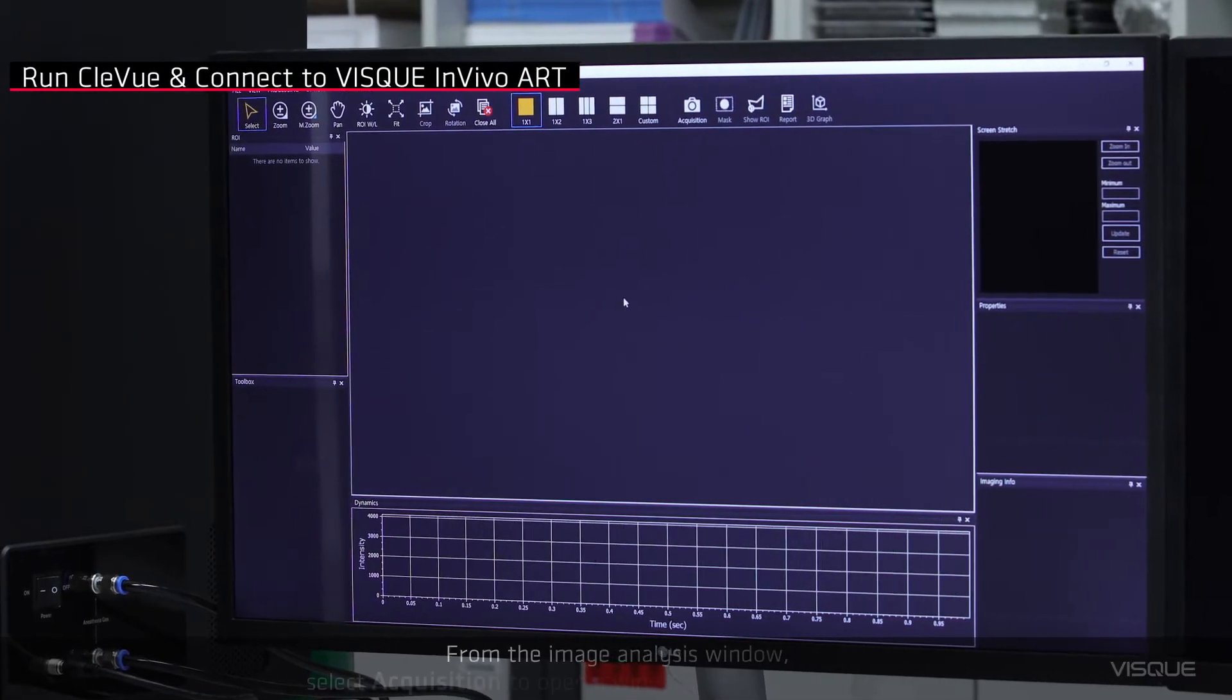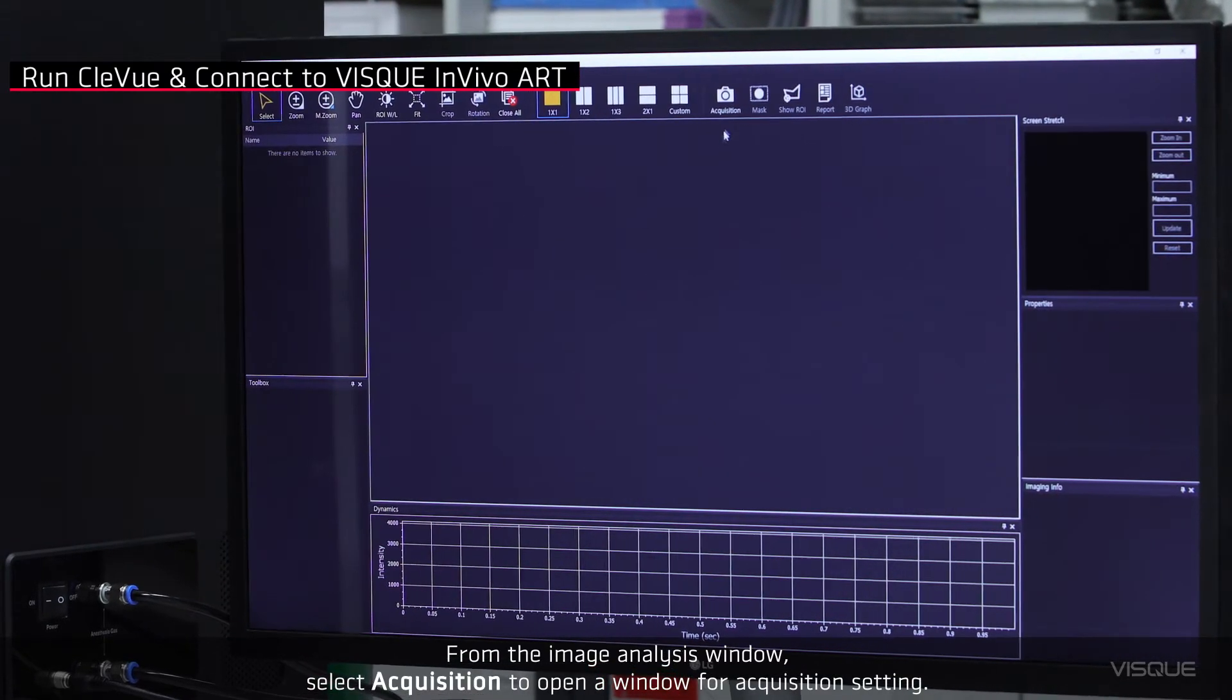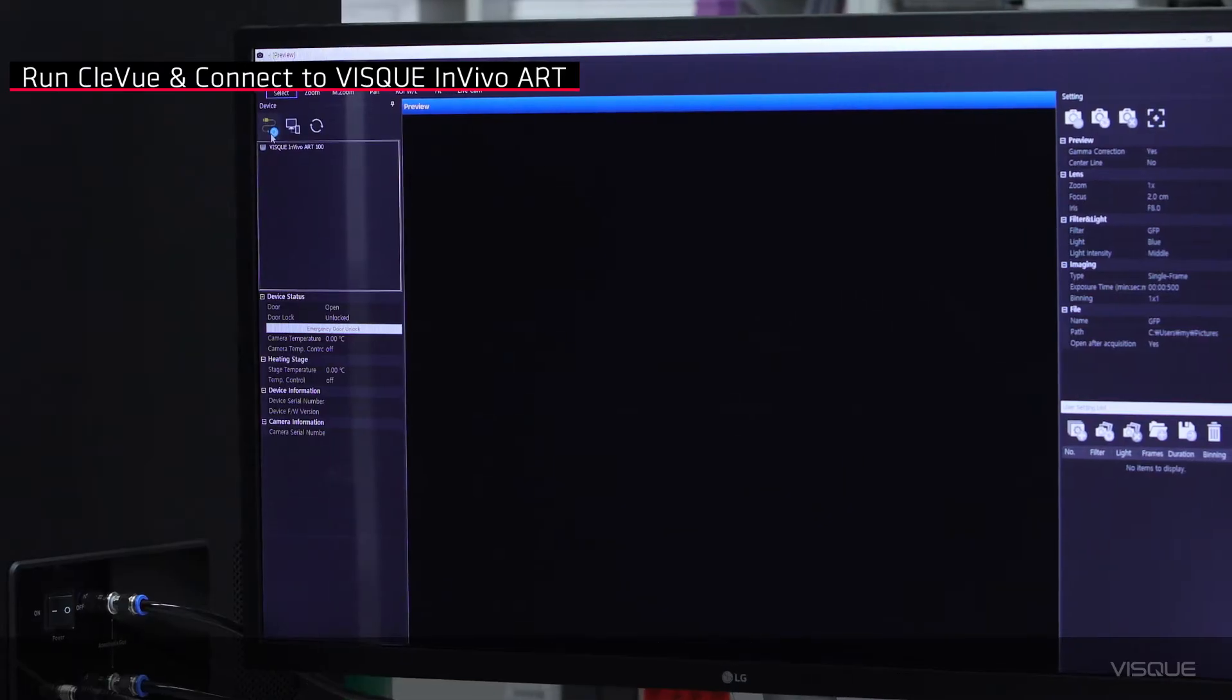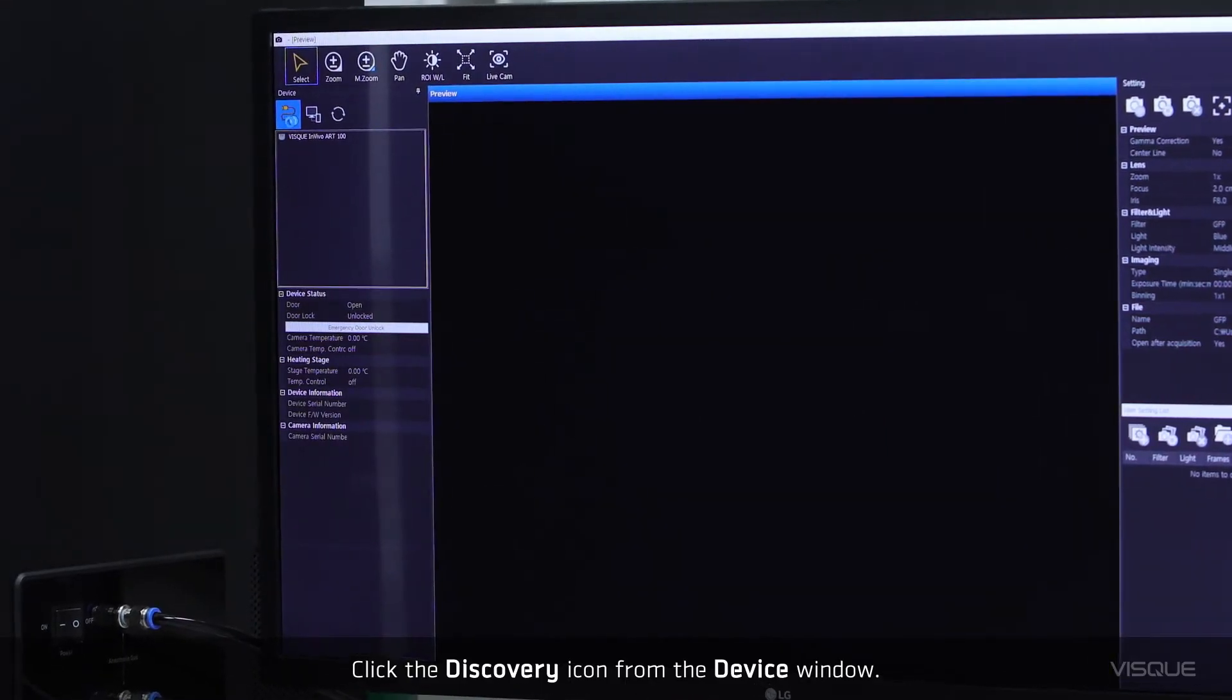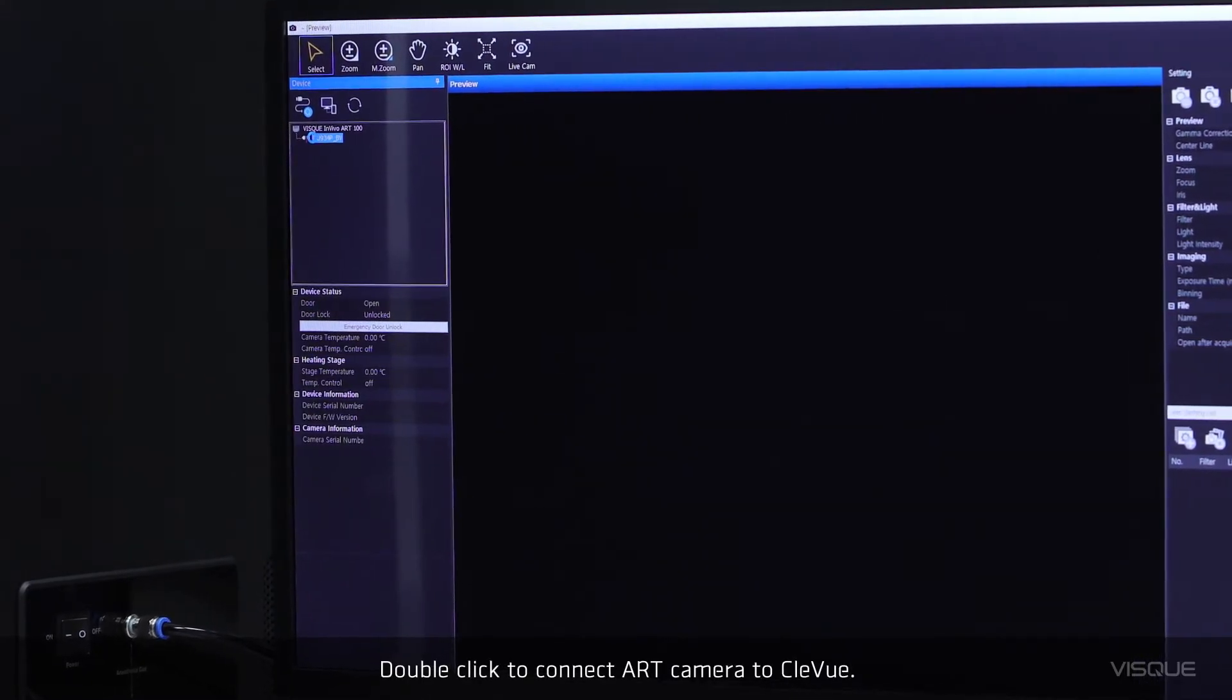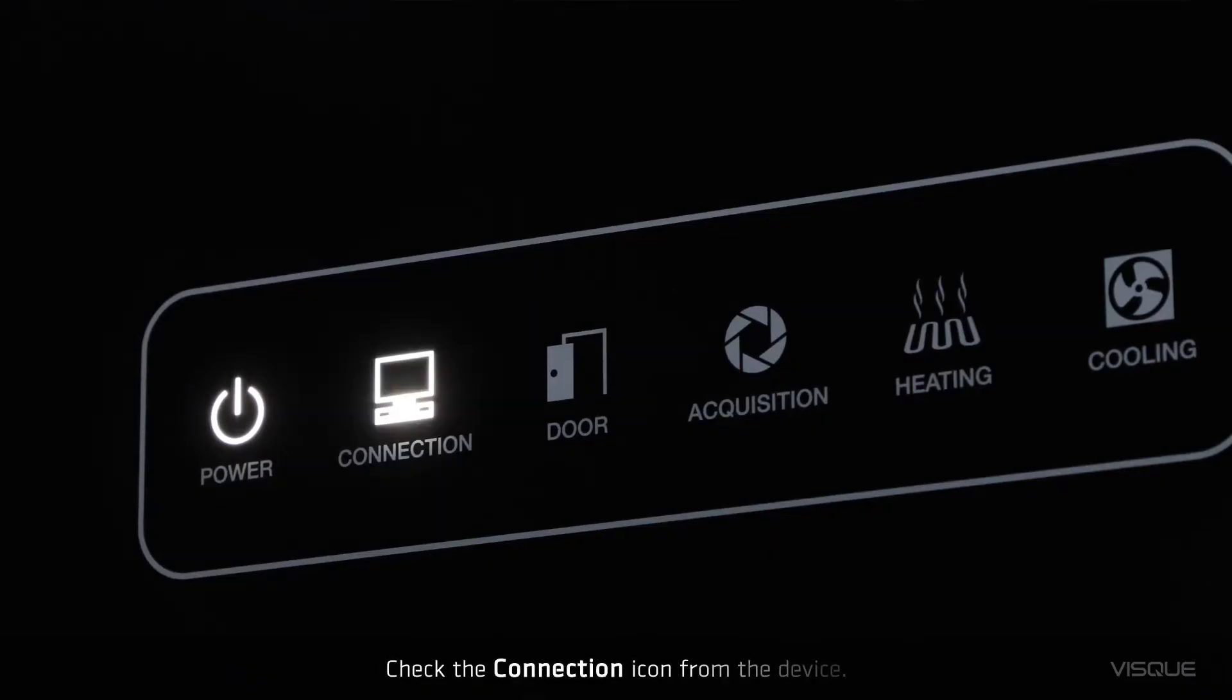From the Image Analysis window, select Acquisition to open a window for acquisition setting. Click the Discovery icon from the Device window. Double-click to connect our camera to CleVue. Check the connection icon from the device.